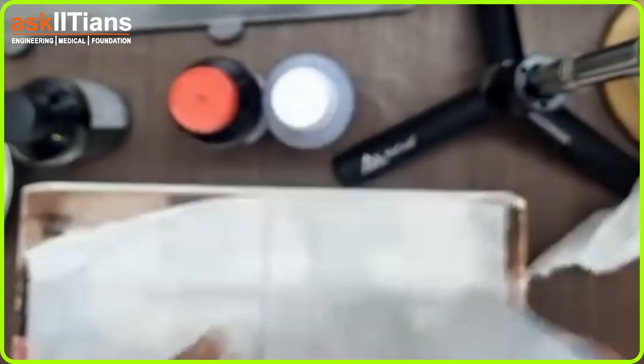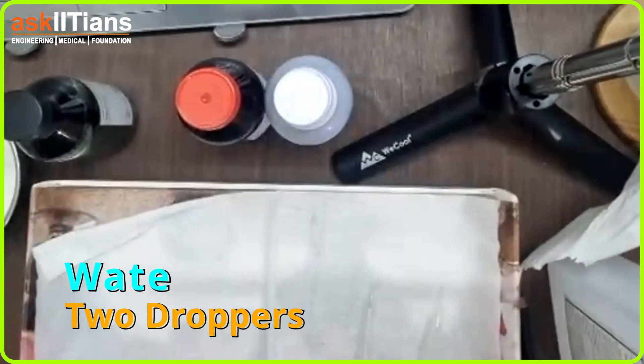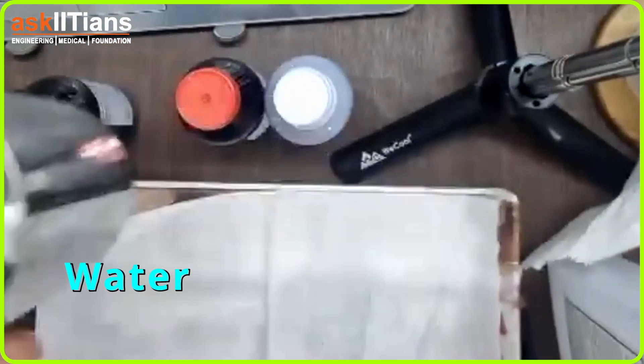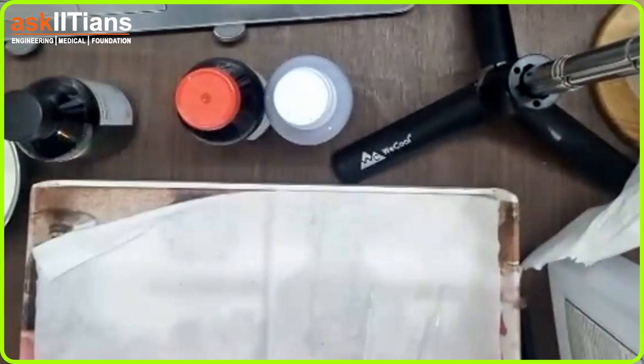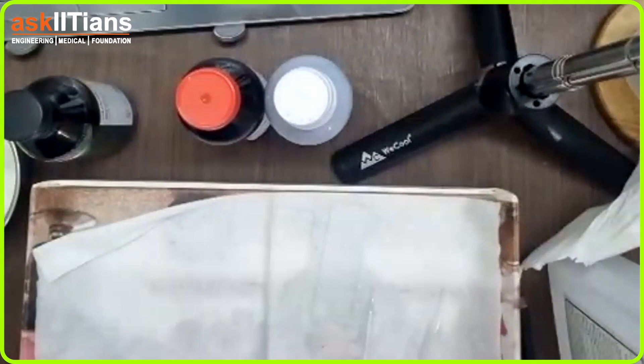We also have droppers and water. I was in a hurry so I just took the water in a glass, but I also have a finger bowl with me. Let's start the practical — first of all, you need to clean your hands because in biology you need to be very sensitive about cleanliness.